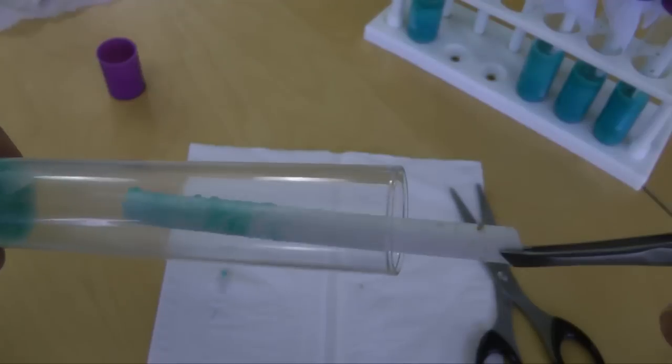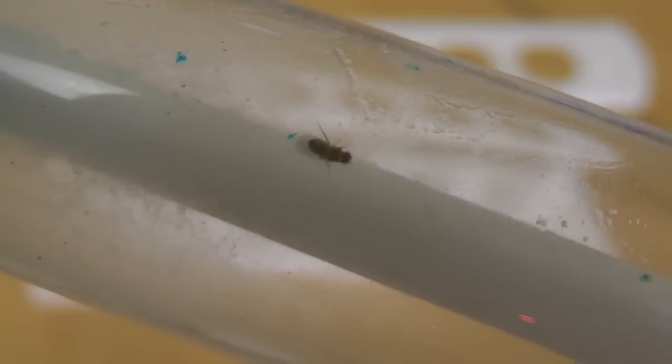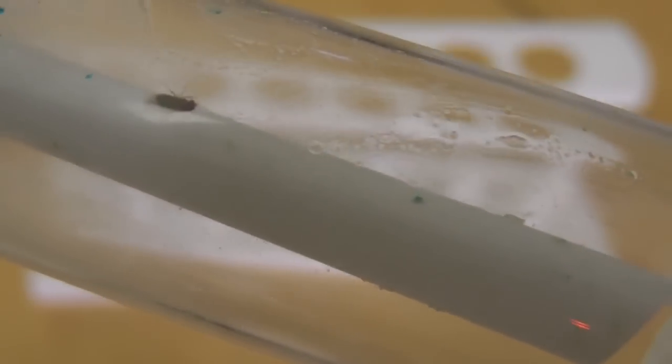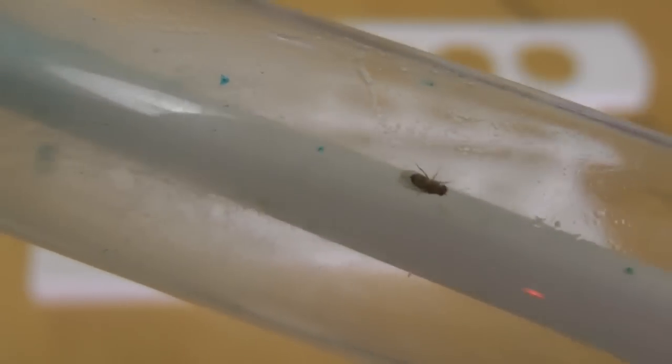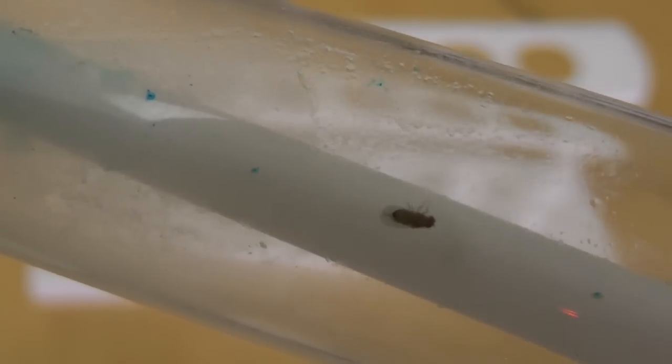I place each pupa in a separate tube. When the flies hatch, we can determine if we have a male or female fly. If we have a female fly, she has been isolated and not had a chance to mate. A virgin red-eyed fly.